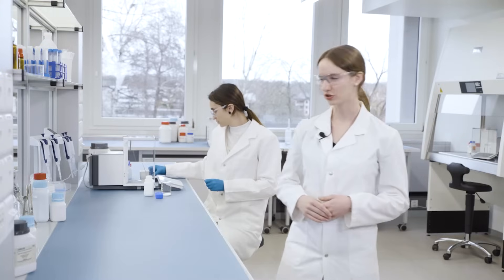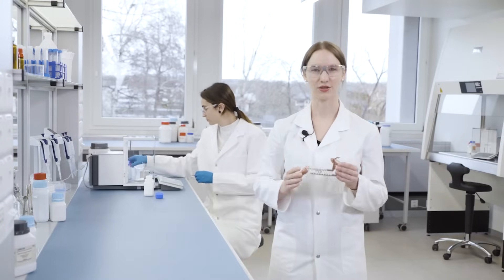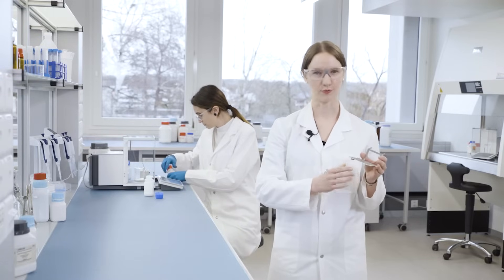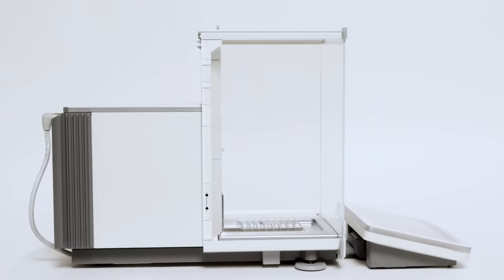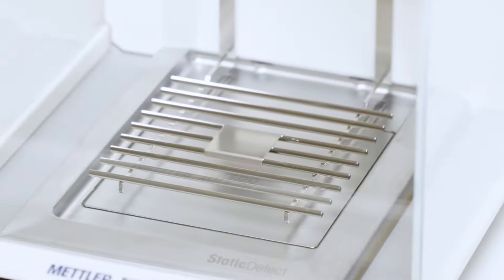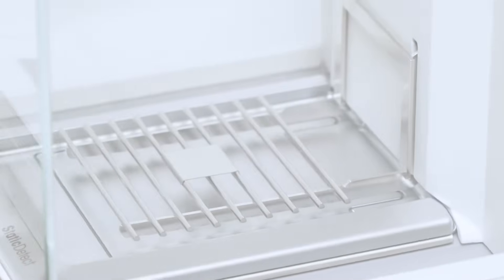Another important contributor to the XPR's exceptional performance is its hanging weighing pan, which is unique on the market. It is attached on the back of the weighing chamber and floats in air, placing it exceptionally low. Thanks to the fully sealed bottom, the risk of contaminating the weighing cell is eliminated, improving the longevity of the balance.